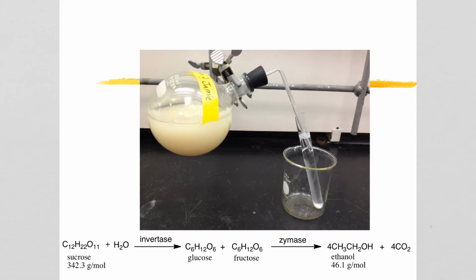Hopefully when you come in this week, you'll see something like this in your hood, where now you have this mixture of ethanol, water, and yeast.